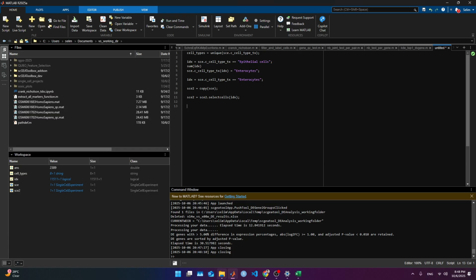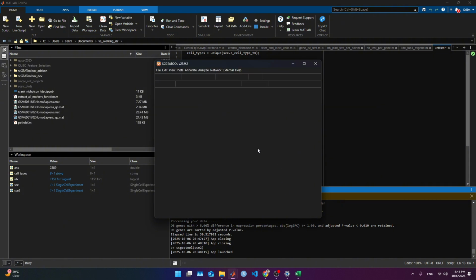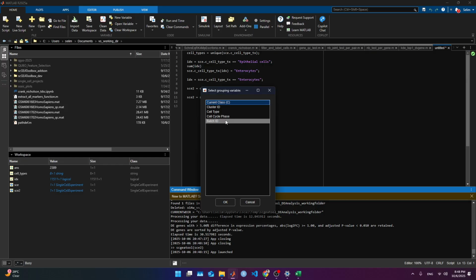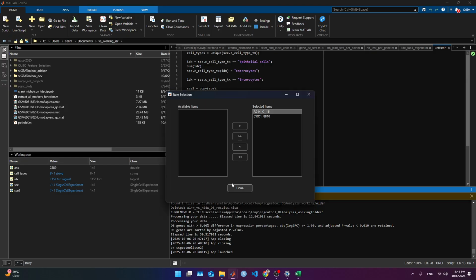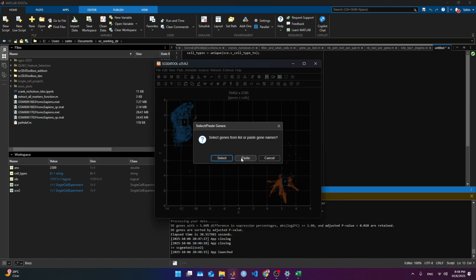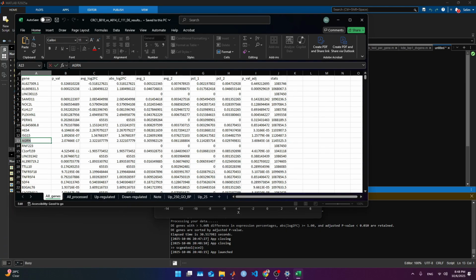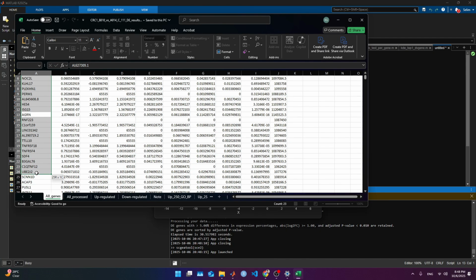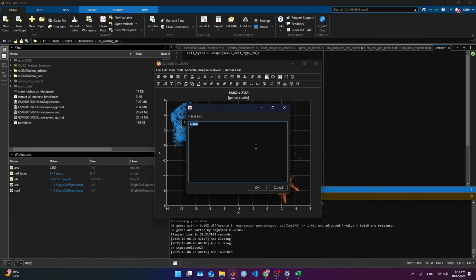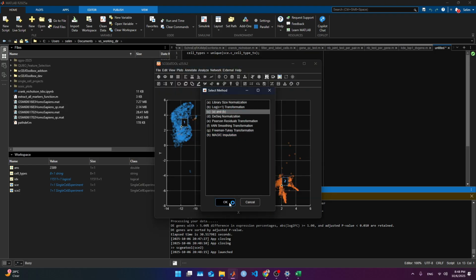Not here. Has to be SCE2. My bad. Okay, plot violin of batches. Sure. And it's going to be gene expression. Paste. Let's copy a set of them. Let's copy all this stuff and let's select one. Let's go back. And okay. Yes. Here A and B.